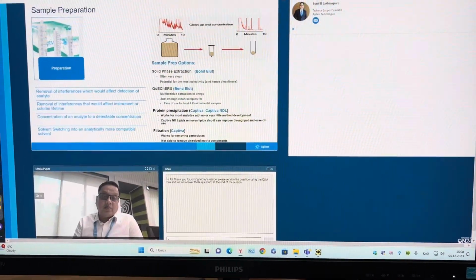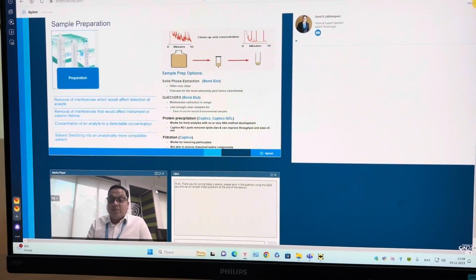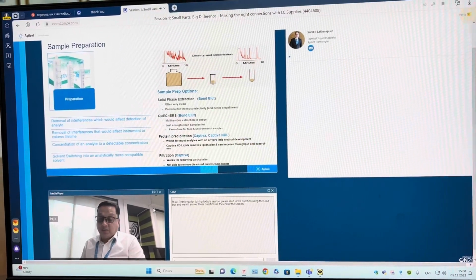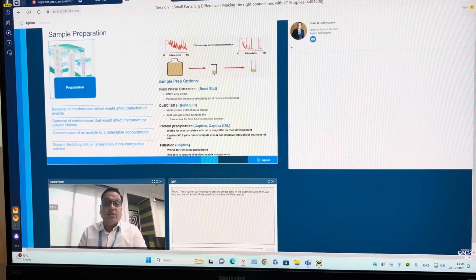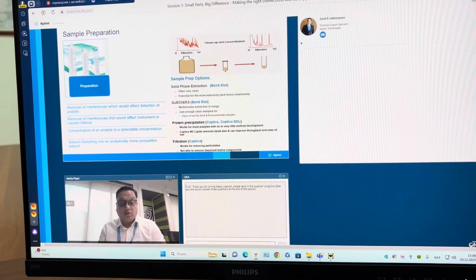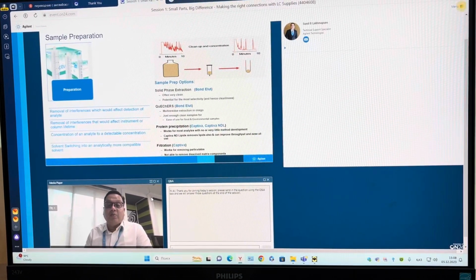And also, as I said, if your sample quantity is very, very less, like if I am analyzing something from a pond, a very small quantity, then I have to concentrate the sample. So there also sample preparation plays a very important role to enrich or concentrate the sample to inject onto a system. And in some cases, samples are in a very strong solvent, such that they will not be able to be injected onto the system. So there also sample preparation plays a very important role to convert the solvent into an LCMS or LC amenable solvent system. So solvent switching can also be done with the help of sample preparation.